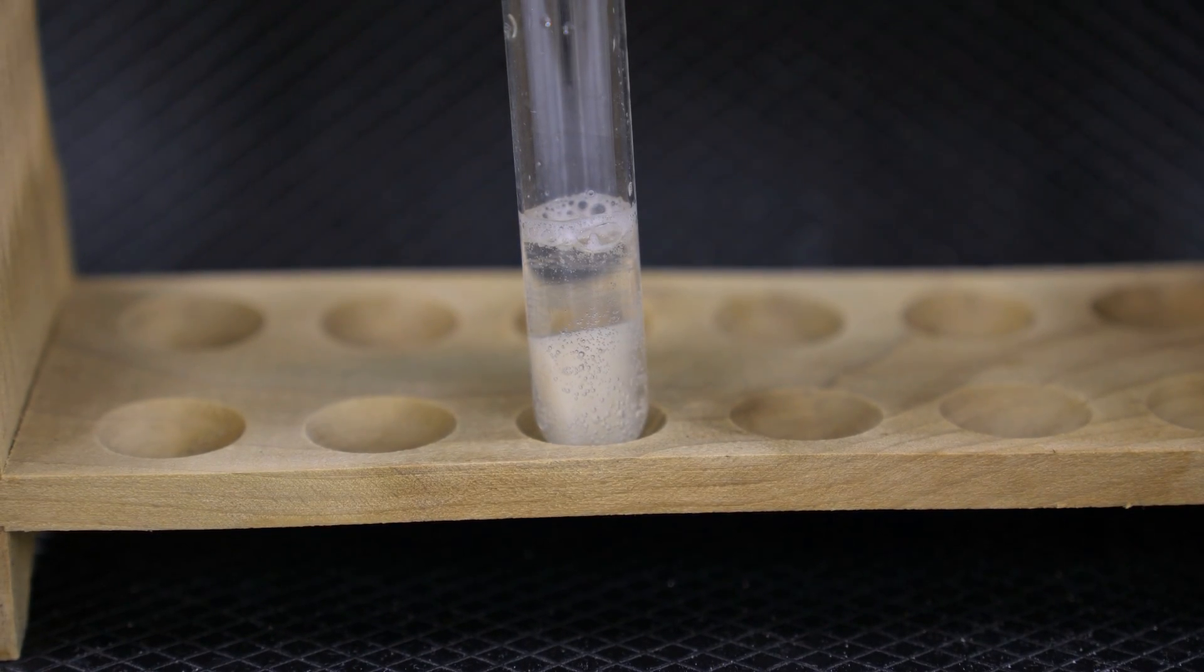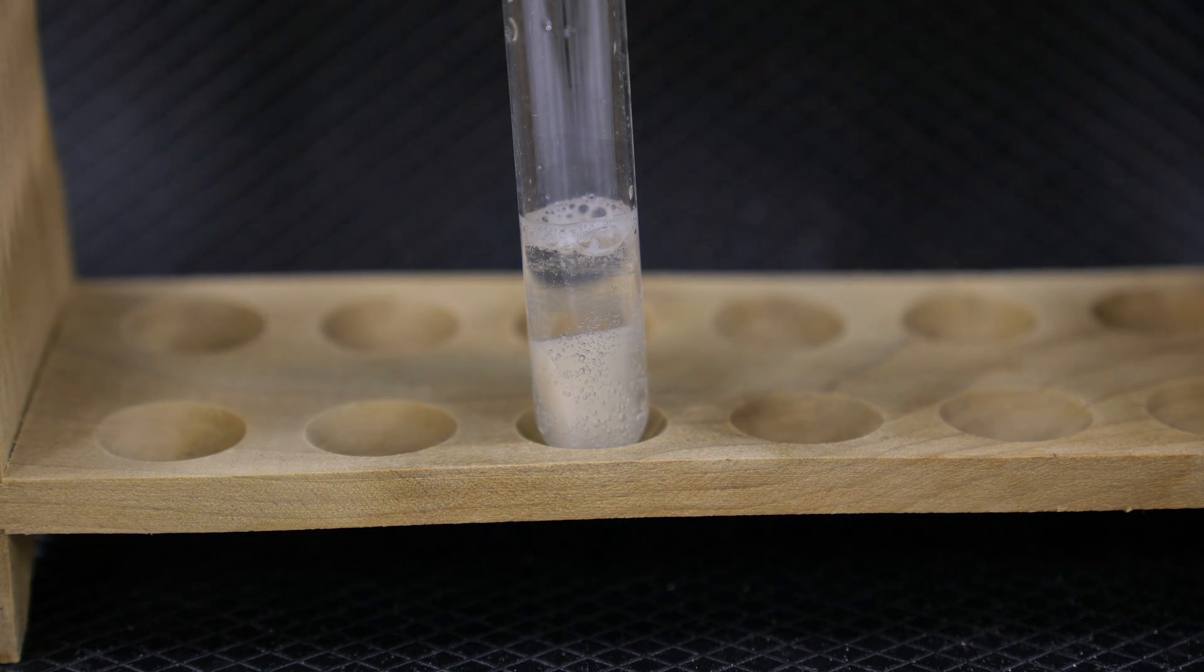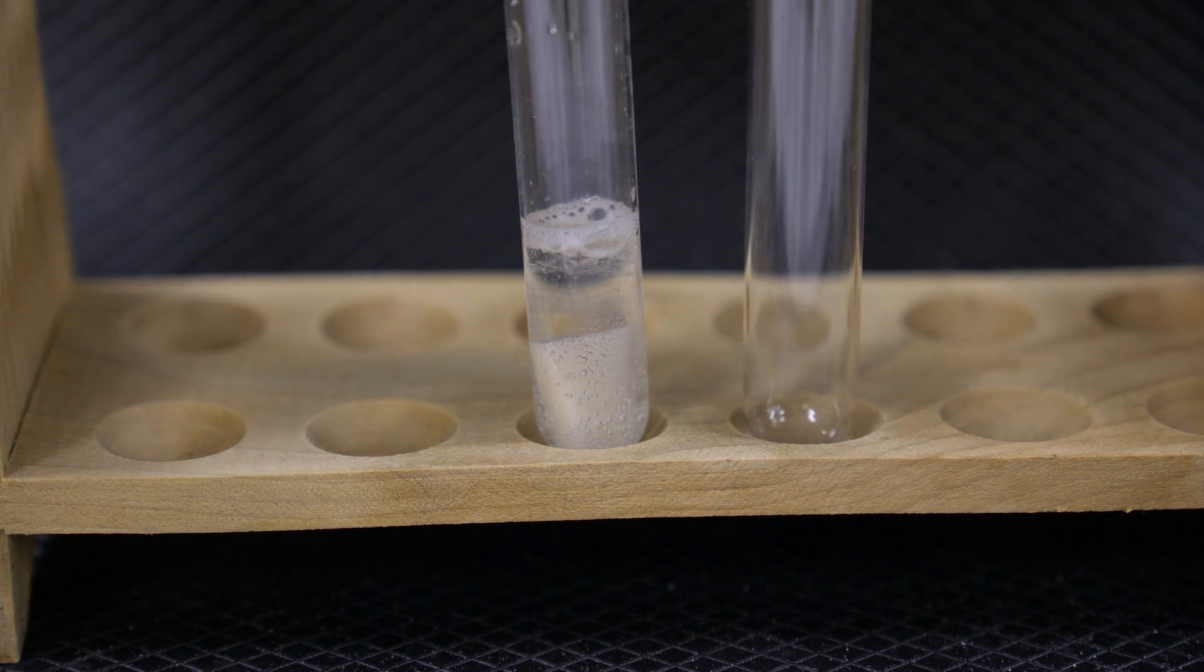So here we are back at our first reaction. We're noticing it's still reacting a little bit, but it's definitely slowed down. We're going to progress with this portion of the lab now. Reading the lab instructions, we're instructed to take the liquid from test tube 1 and put it into a second test tube.